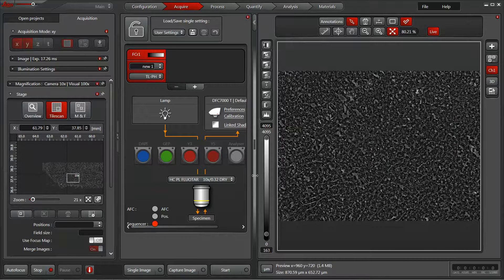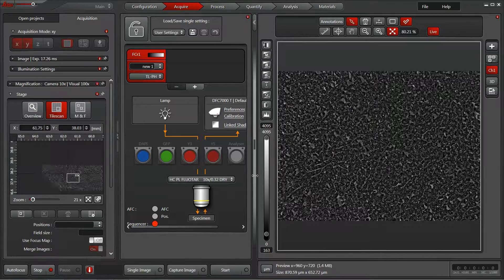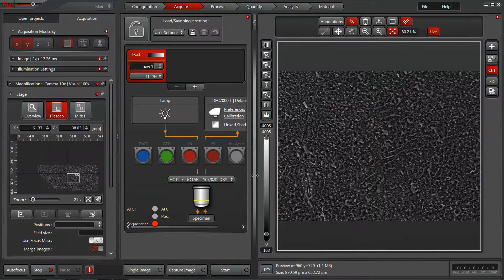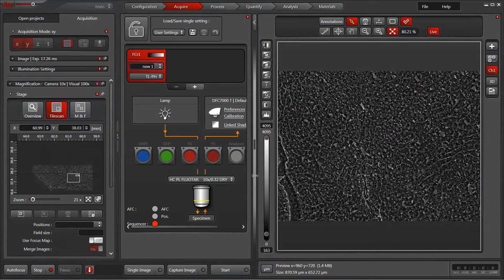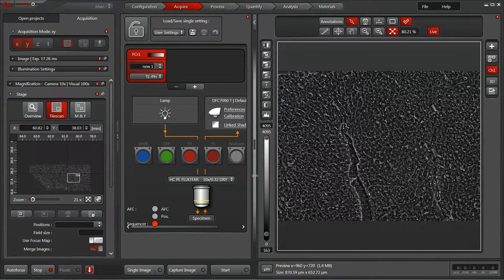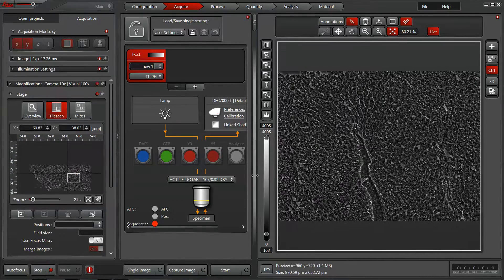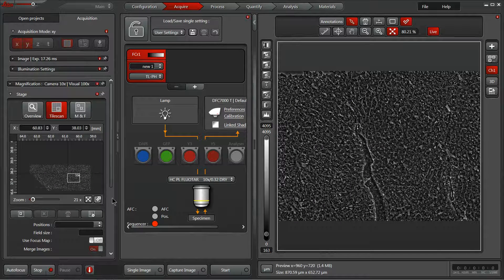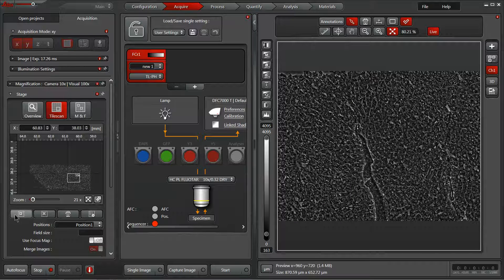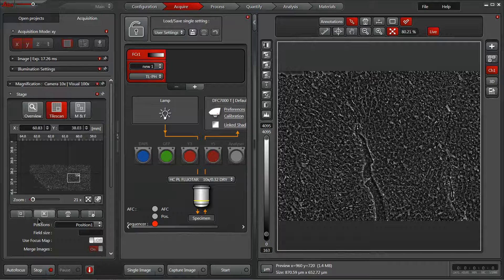But what you could also just do is look through your sample and find areas of interest. So you could say, this is a really important field of view for the work I'm doing. I'm going to mark that position with our far left square within a square mark position option.